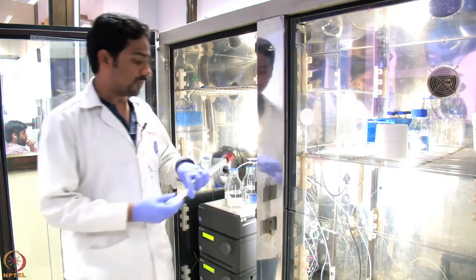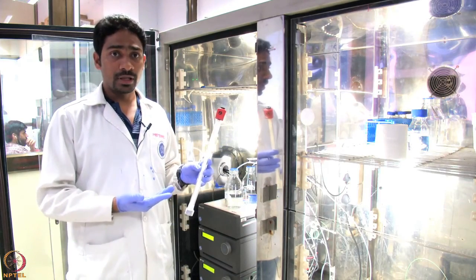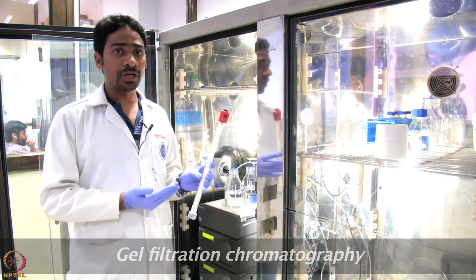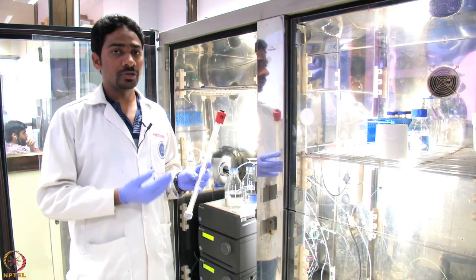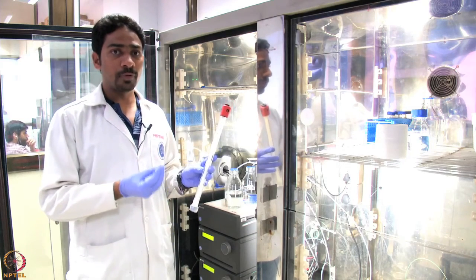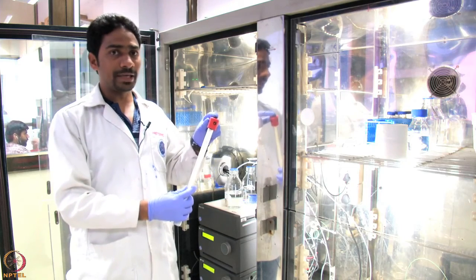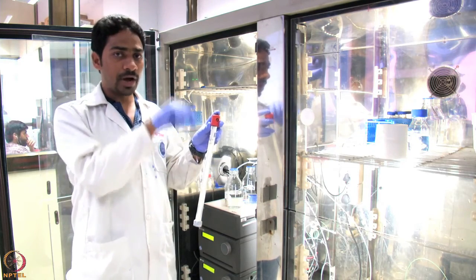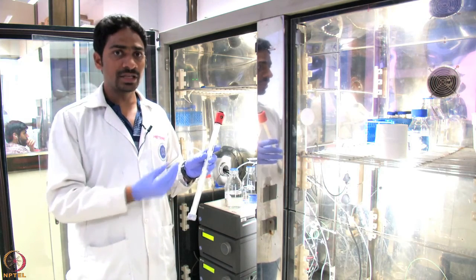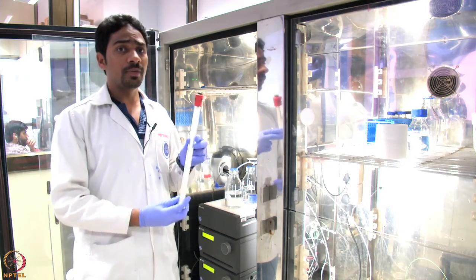Like here you can see this is one column, that is Superdex 200 column, which is used for the gel filtration chromatography. So here we can separate the protein on the basis of their sizes. So the proteins having a higher molecular weight will elute first, and the proteins having a smaller molecular weight elute slowly. Once we put the sample, the small protein will pass into the pore of the beads and they experience more resistance, more friction, so that's why they move very slowly. So here we can separate the protein on the basis of their molecular sizes.